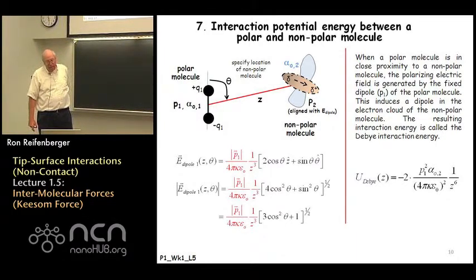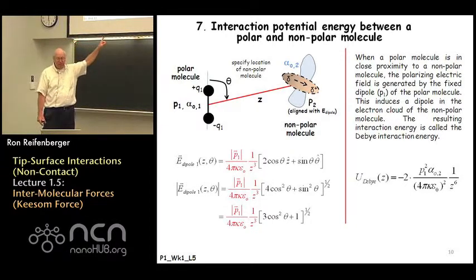And if you calculate the interaction potential energy now between the polar molecule and the nonpolar molecule, the interaction potential energy is referred to as the Debye interaction, and the answer that you get for the Debye interaction is indicated on the right-hand side of this slide.